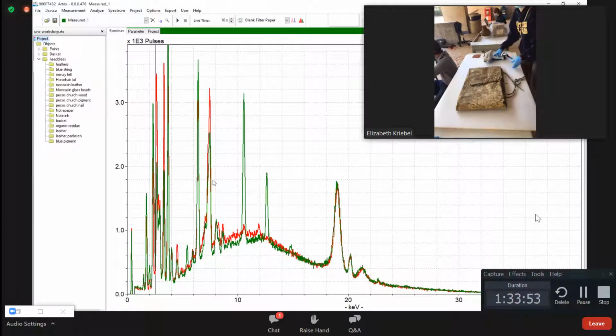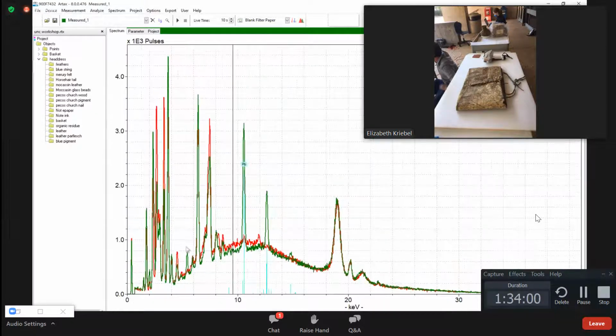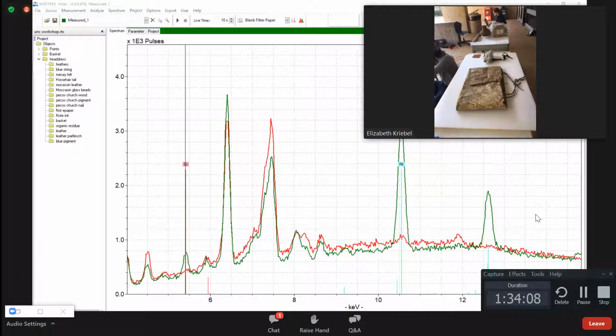And so in the green pigment, we have two new elements. The first element is lead, and the second element is chromium. I'm trying to remember. I need to Google it. The first thing that comes to mind is viridian green, but I don't know if that's accurate. Just a moment. Google to the rescue. When I was still in practice traveling around the world, I had all these pigments just indexed. Yeah, hydrated chromium oxide. So yeah, my guess would be viridian green mixed in with like a lead prime, or even lead white, which would be lead carbonate, and then you just kind of add the other thing and mix the two. But either way, both lead and chromium are present. So, cool. All right.